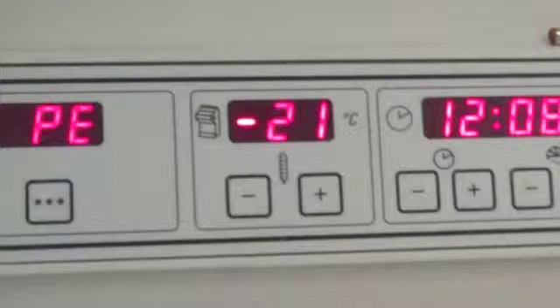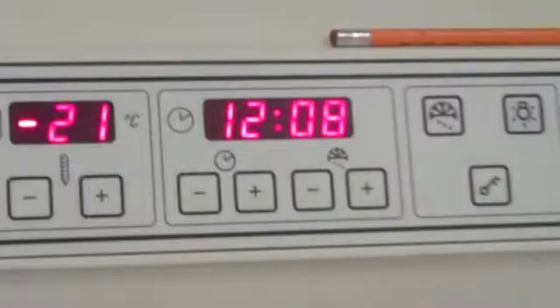These are the temperature control buttons. For optimal slicing, set the cryostat between -20 and -22 degrees Celsius. The cryostat also contains a clock, which it uses for the 24-hour defrost cycle. Use the plus and minus buttons under the clock icon to set the time. Use the plus and minus buttons under the snowflake icon to set the defrost.